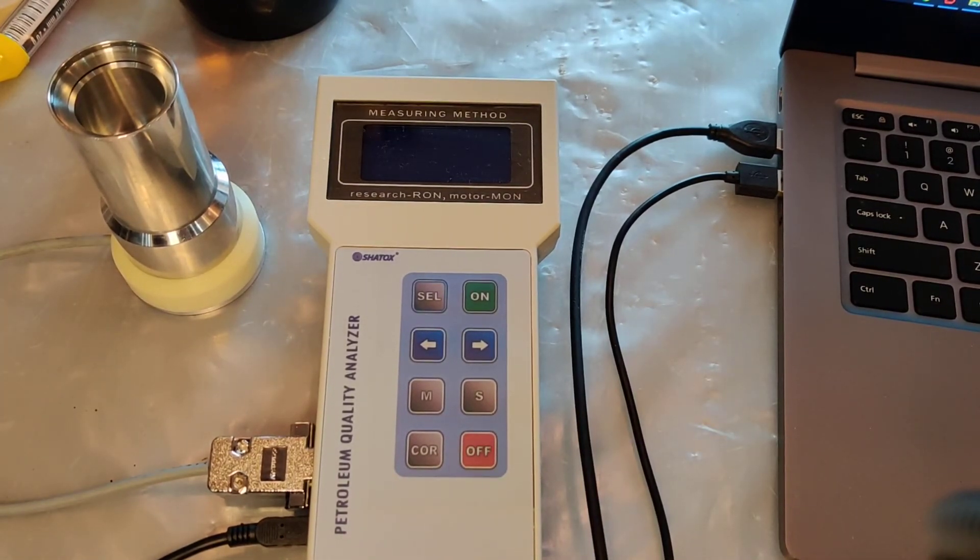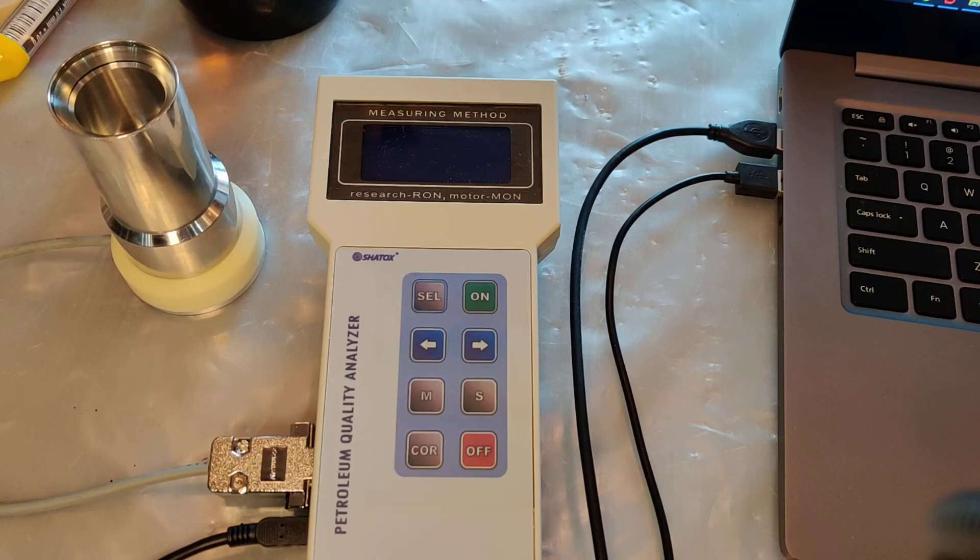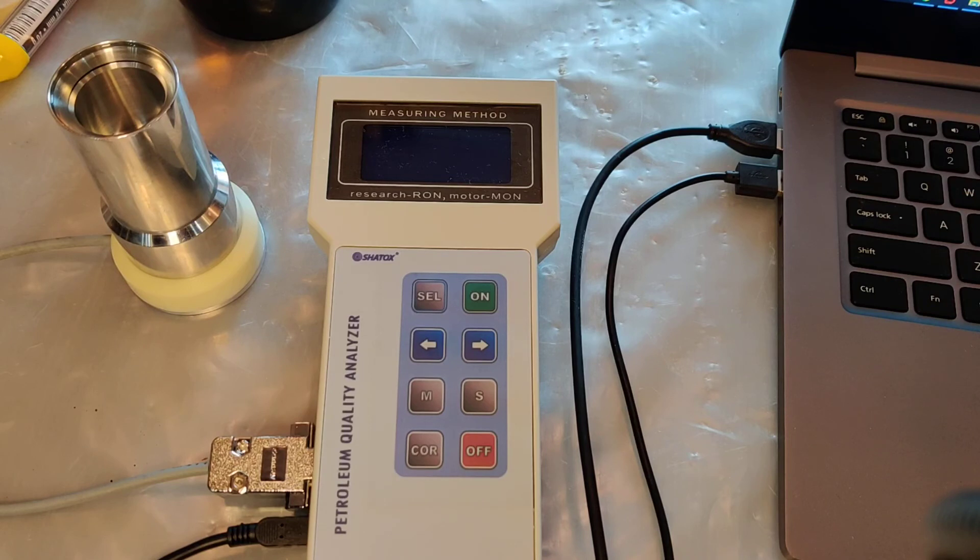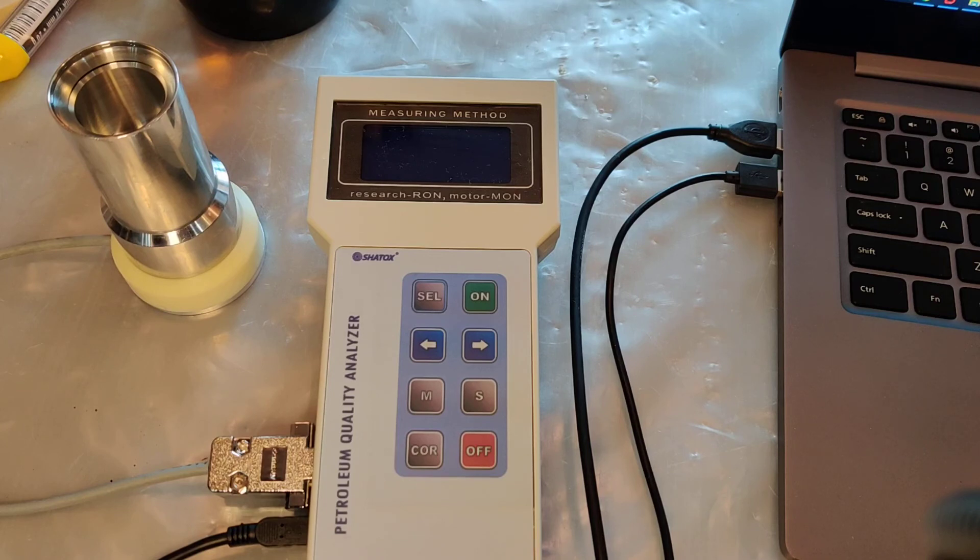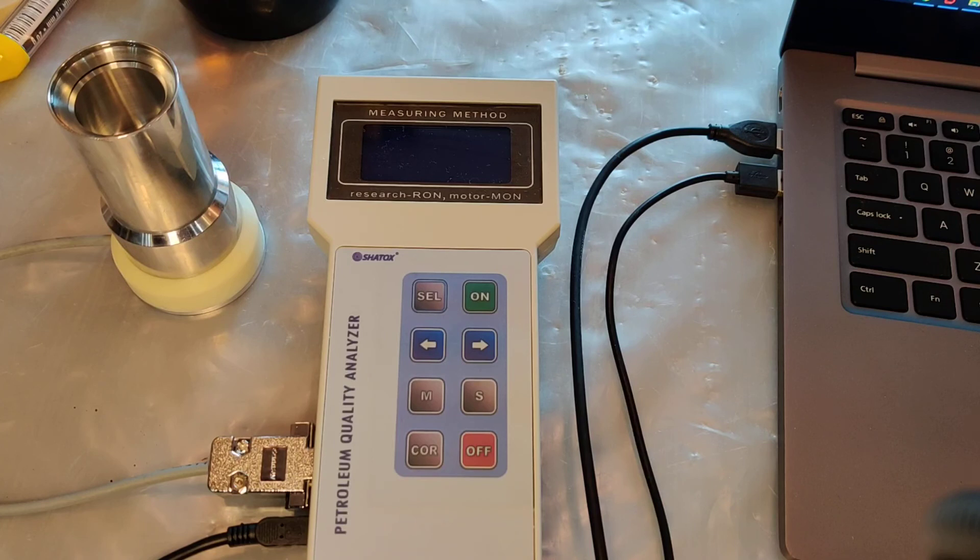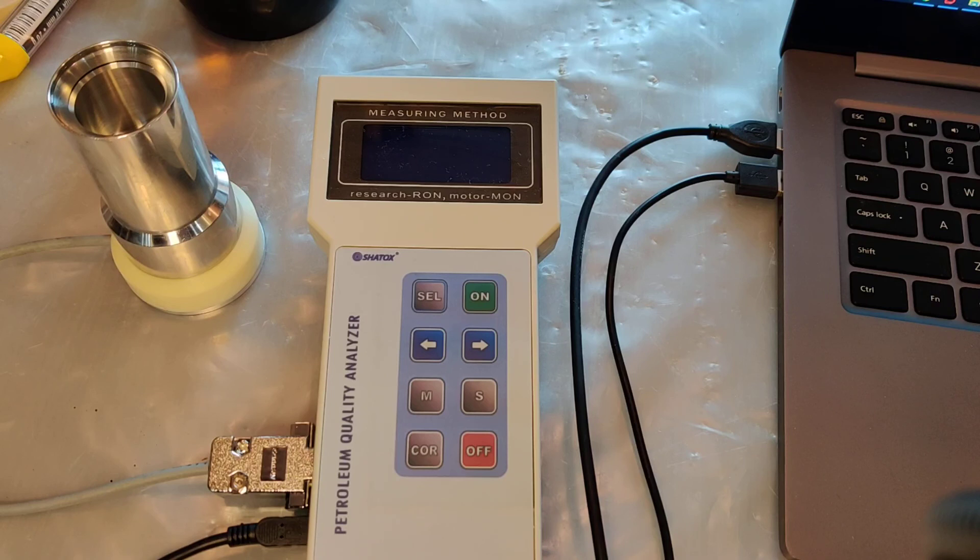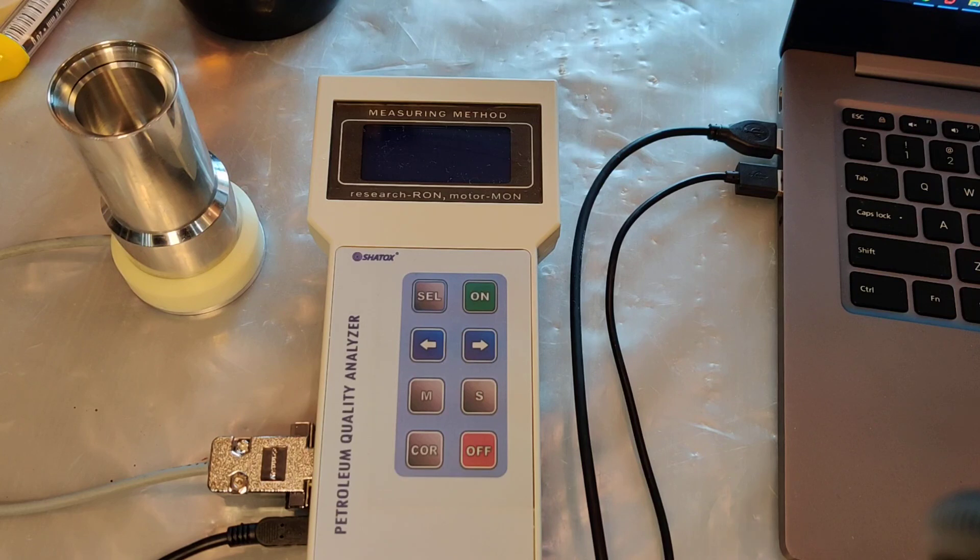Also you can perform calibration with gasoline. For that you switch your instrument to octane mode and for that you also need to know the accurate octane number of your gasoline. So you pour the gasoline with a known octane number and rotate the screwdriver until you get the desired octane number. After that your sensor is calibrated.